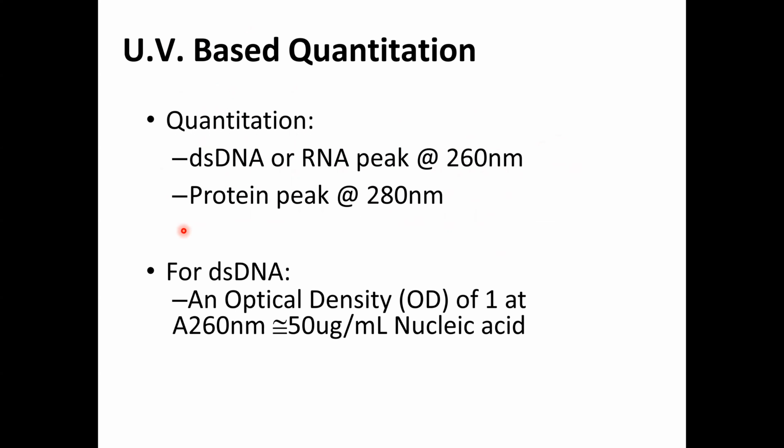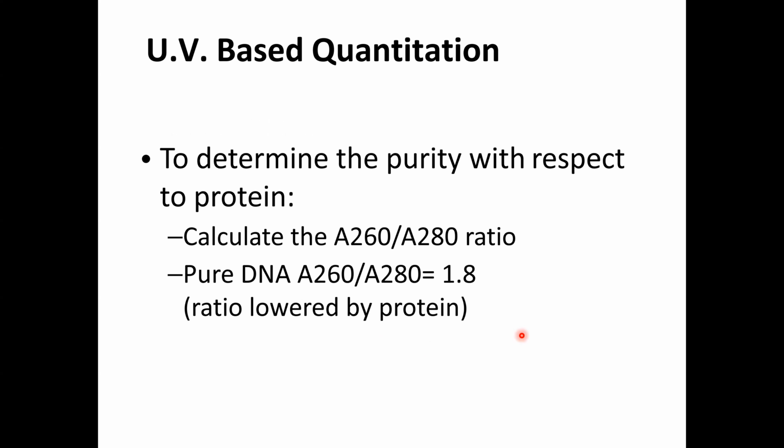For double-stranded DNA, an optical density (OD) of 1 at 260 nm corresponds to 50 micrograms per ml of nucleic acid.